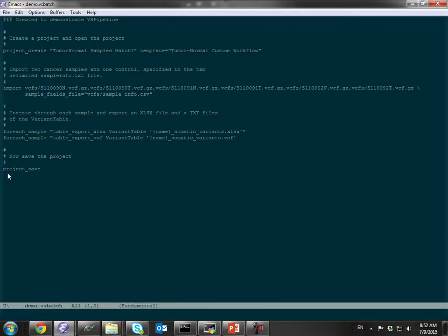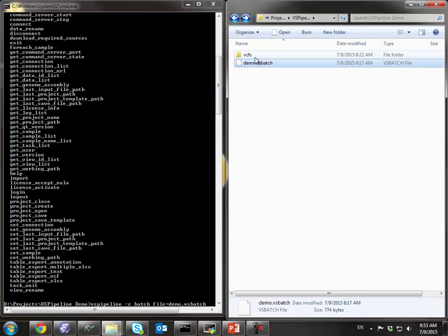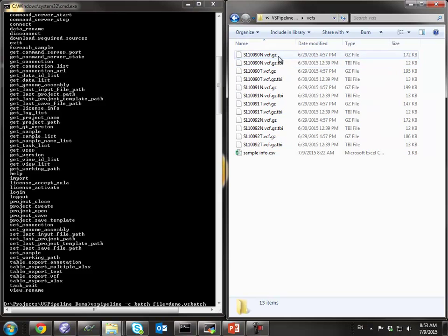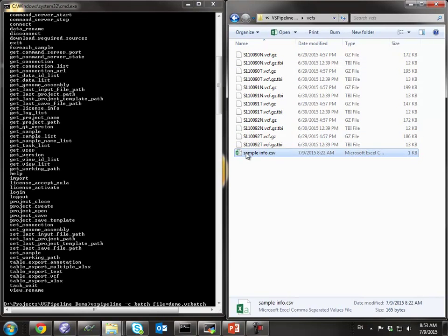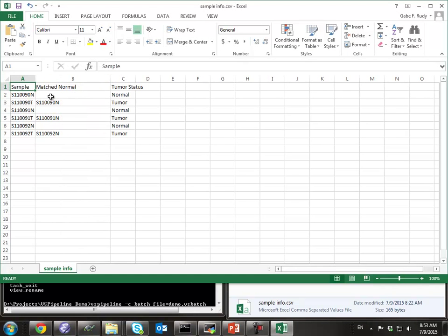Demo.vsbatch is just a series of commands in VarSeq Pipeline's command syntax. All this is documented in our manual, but it's very simple and easy to pick up. You can see we have a command to create a project — the important thing is we get to define that workflow, which is the tumor-normal custom workflow that I defined. We import some VCF files from the current directory, and it also has sample mapping information. In this case, I'm importing three tumor-normal pairs, so this sample info maps the tumors to their normals. Then we're going to export an Excel file and a VCF file for each of the tumors in our project. We do automatic compression and indexing of VCF files for you. If I was running a family-based workflow, I would define matching between children and their parents.